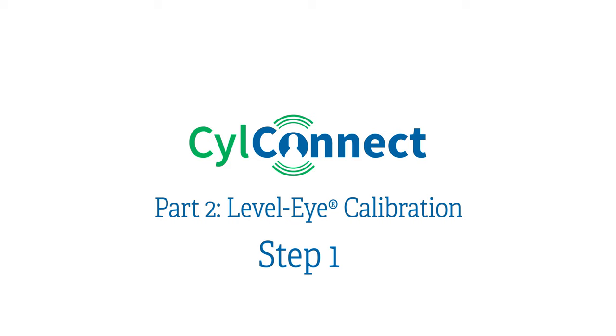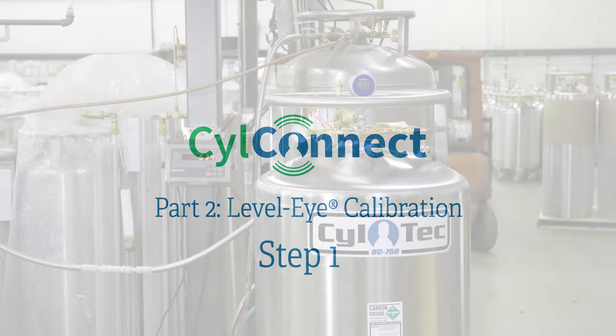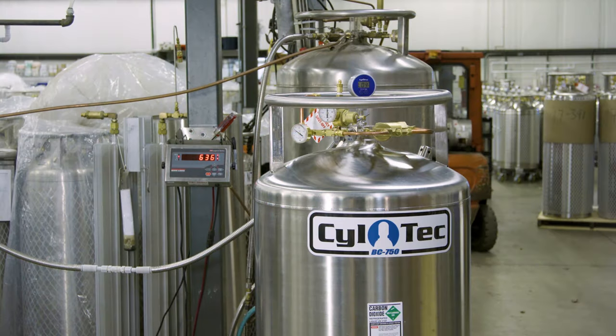Part two: Level-Eye calibration. Step one: place the tank on a scale and fill it by weight. Fill the tank with five to ten pounds of liquid and allow the wand to chill for five to ten minutes.